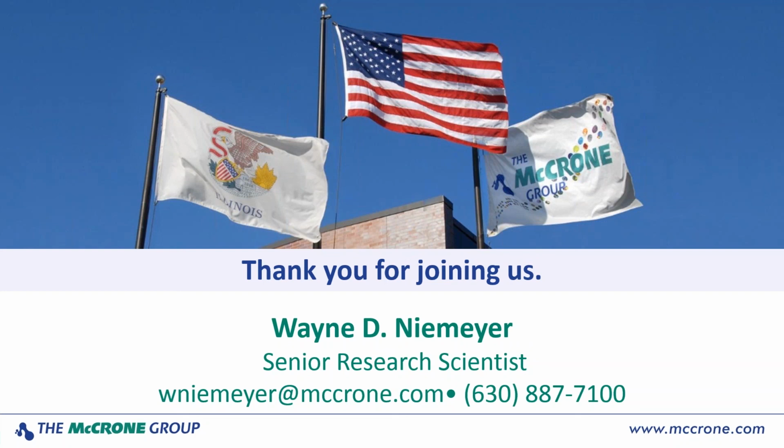The ring light is producing like a cone of light. Think about the perimeter of a cone coming down to the focus point on your sample, and it's illuminating at that focus point all the way around the entire field of view. So it's really eliminating all the shadowing effects with the ring light. And that's what makes it more difficult to see features on smoother surfaces when you're using a ring light for your illumination compared to the coaxial illumination.